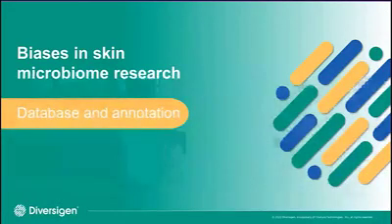Once we have collected the skin microbiome samples and extracted the DNA, the next step is to analyze the data. However, we know that there are biases that are also associated with data analysis, so let's talk about some of these biases today.